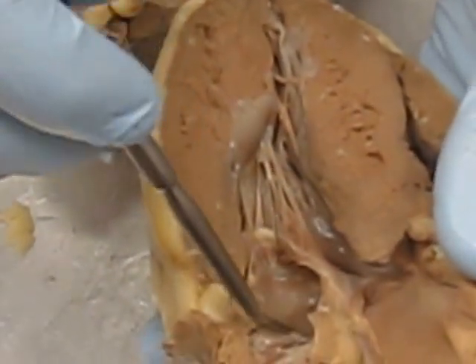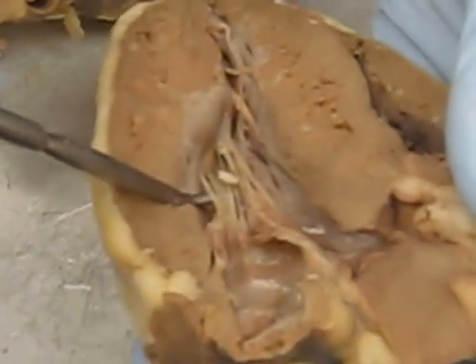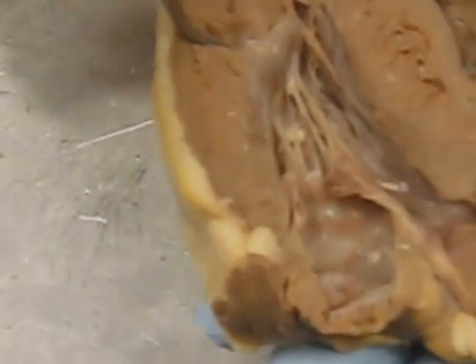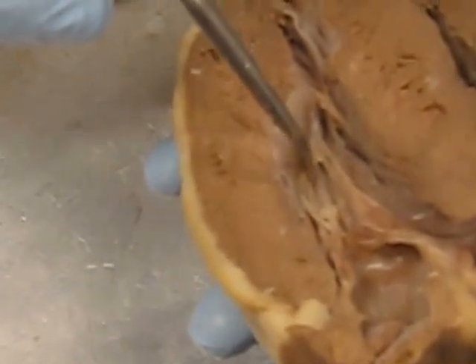From the left atrium we travel down the bicuspid valve — also called the mitral valve — into the left ventricle. These right here are chordae tendinae, also called your heartstrings, if you ever hear that euphemism. Here's some more trabeculae in there as well. The points of attachment for the chordae tendinae are called papillary muscles.